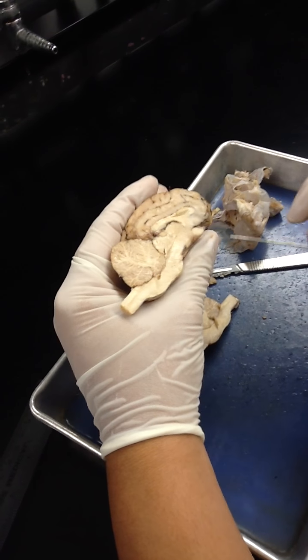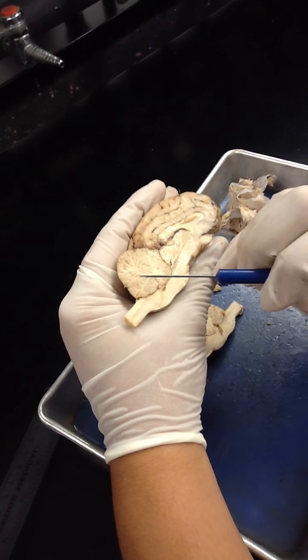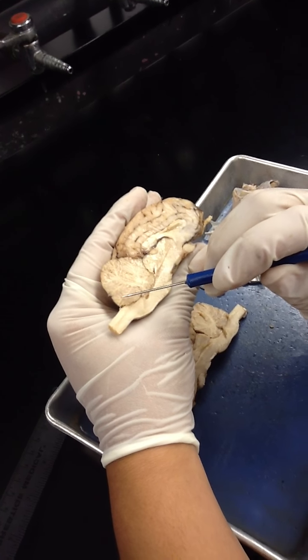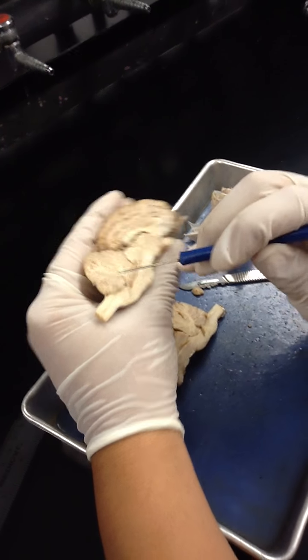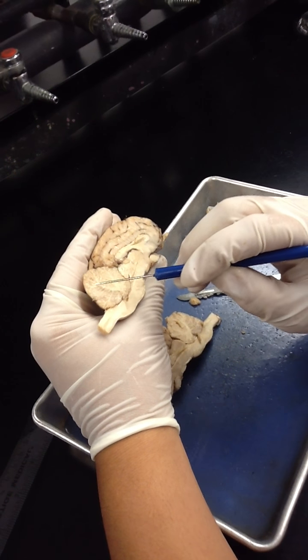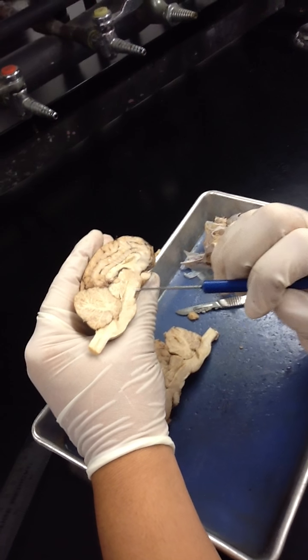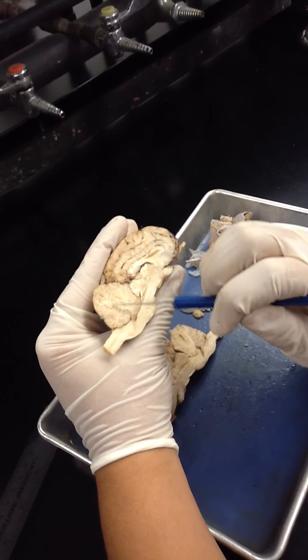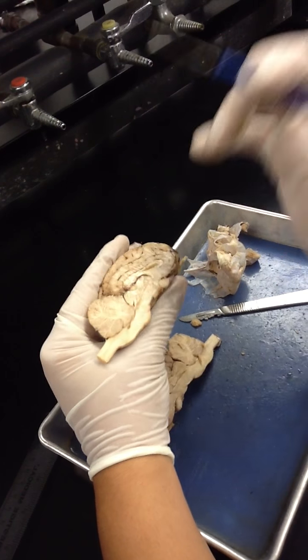First of all, I told you that the more surface area you have, the more gray matter you have. So I want you to see that this is white matter in the middle, and there's gray matter all the way around that white matter. You see those little veins of white matter? Everything else around it is gray matter. It looks like a tree. The white matter is called arbor vitae, the tree of life. I don't know why it's called that, but it is.